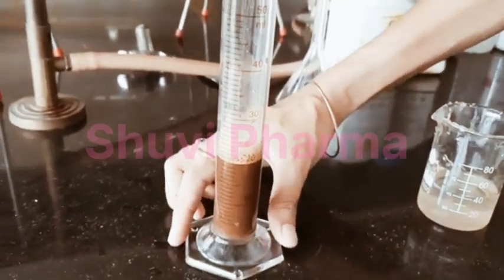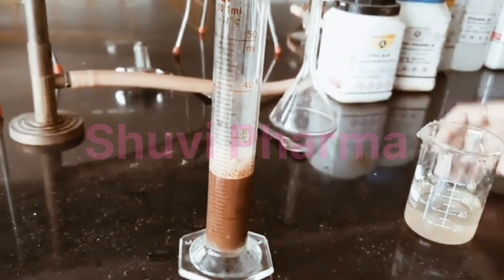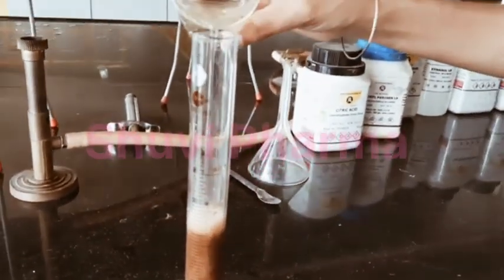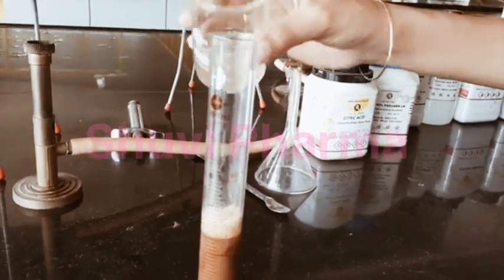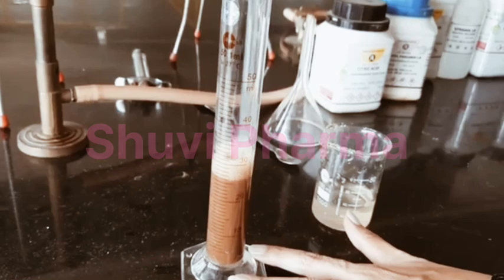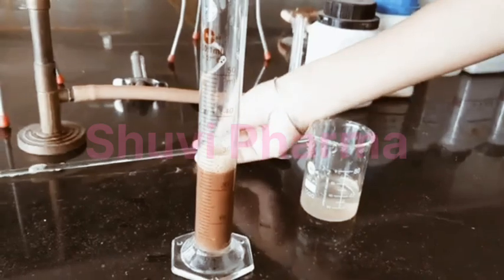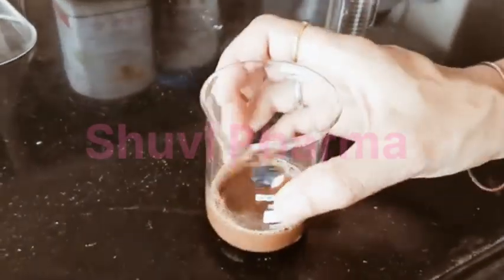To this we have added 1 drop of perfume and preservative, that is methyl paraben solution. To make up the volume up to 25 ml, now we will add the gelatin solution, and we will mix this properly. So here 25 ml of shampoo is prepared. Now we will fill this in a container. So this is our final shampoo.